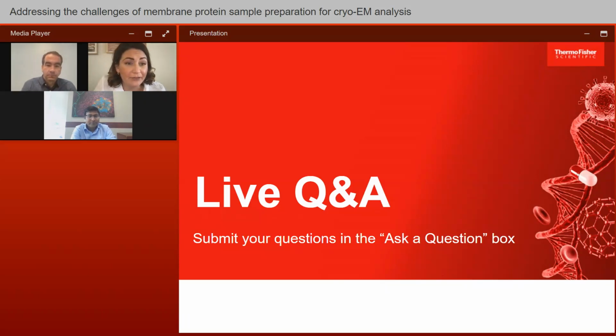For me, definitely, because dissociation is a problem, right? You get a large number of particles that also don't have Fab bound, and so we process those as well. They did not go to high resolution in this case. Other strange things can happen as well when you're using the nanodisc system, like multiple monomers can go into one nanodisc, and that can bump one Fab off or the other.